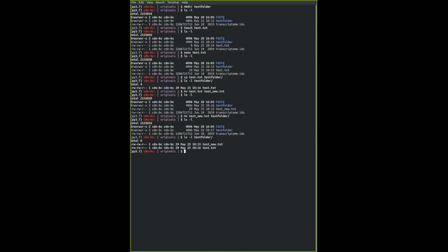Then we also learn how to remove or delete an entire directory, which, again, be very careful when you do this. The command is rm, short for remove. Because this is a directory, you need to provide -r, which means recursive. So it deletes the contents of this folder, including all subdirectories, subfolders and files within. All right, so I'm going to remove the test folder, which I don't need right now. Just remove the entire thing, and you can see that the directory no longer contains this folder.